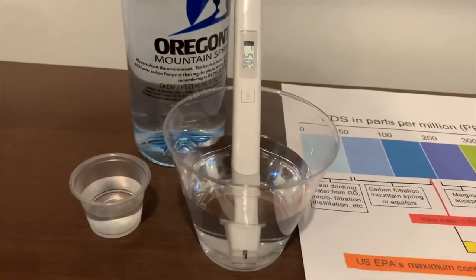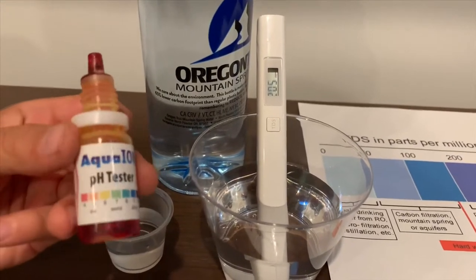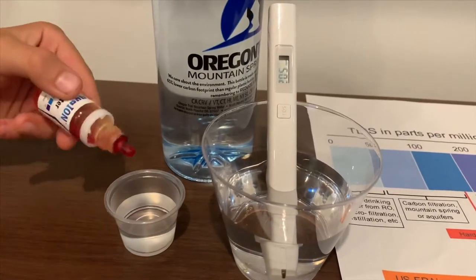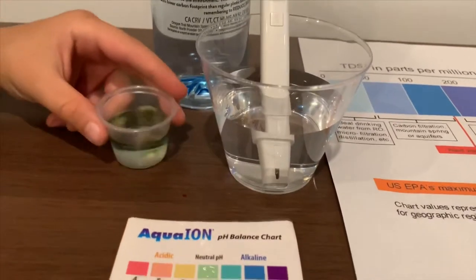Now, let's test the pH. If you want to buy this pH tester, check the link down below. Only do two drops. Let's stir it a little.